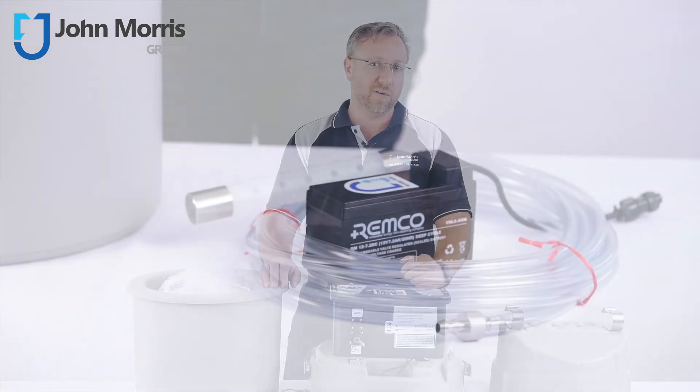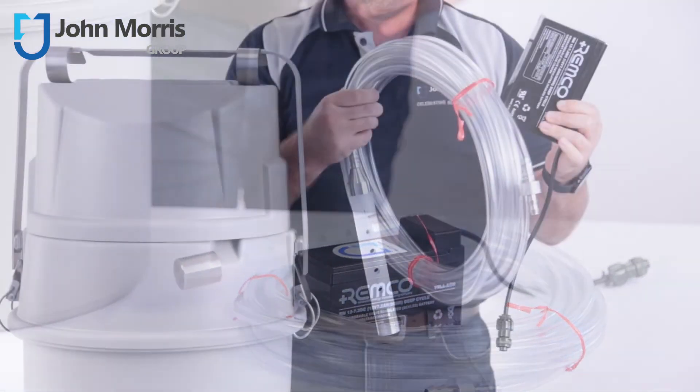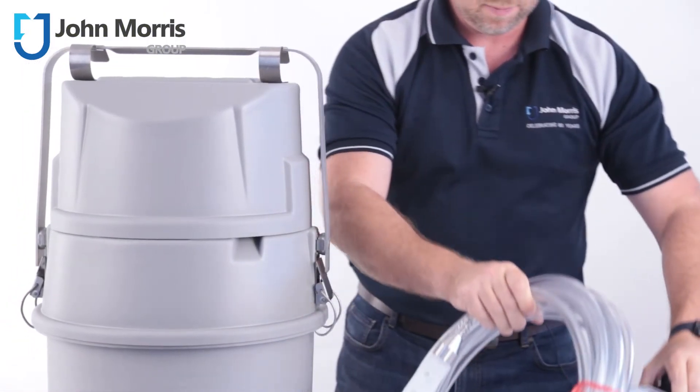You can power this device via 12V DC or an AC converter. Don't forget to purchase your suction line and strainer as well as power supplies when you order.